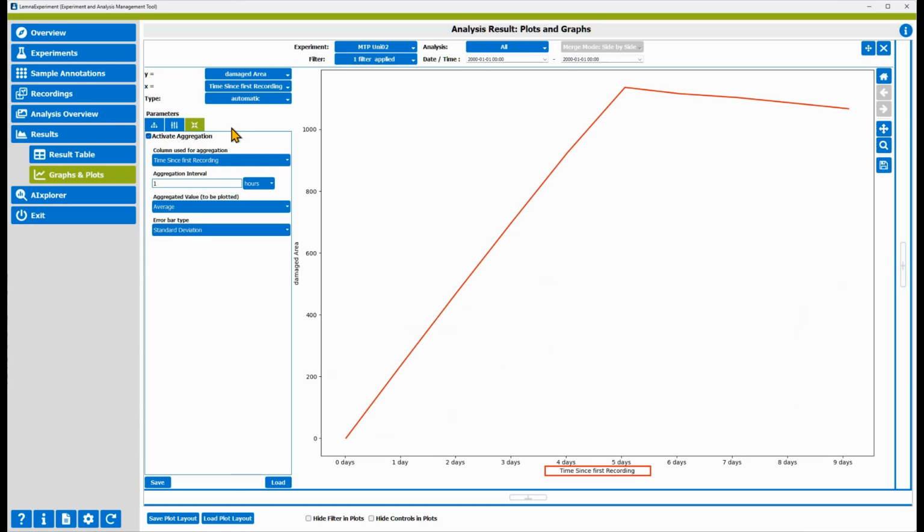For instance, maybe you could not afford to execute the whole experiment at once, so you run one half of the samples in April and the other in May. Using only recording timestamps, any plot versus recording time will restart halfway through the time of the experiment. Using time since first recording aligns both legs of the experiment.